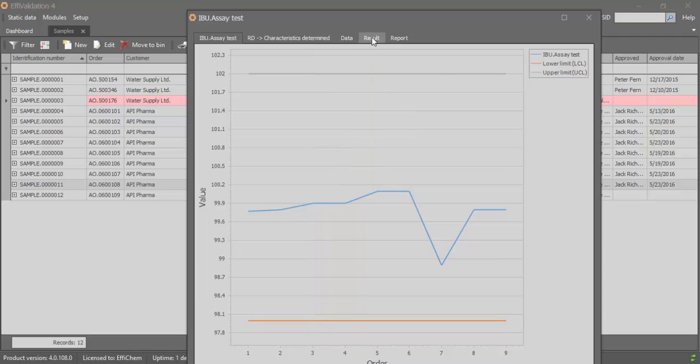One of the other things that this trending function does is it gives you a sigma number. Now this corresponds roughly to the concept of Six Sigma, graded accuracy information, which helps you understand more effectively how your quality is shaping up in the lab. We've learned that improvements of only 1 sigma in quality over the course of lab data can have 15 to 25% improvement in overall laboratory revenue. That's not just quality based, that's overall.